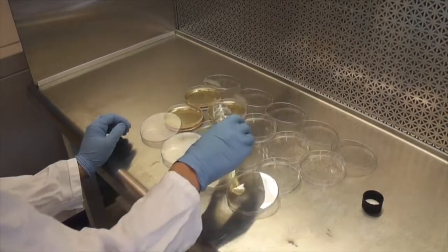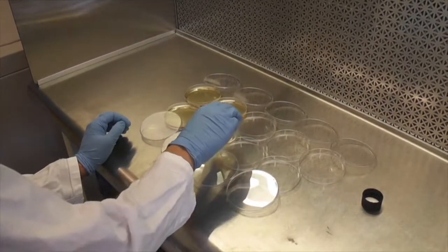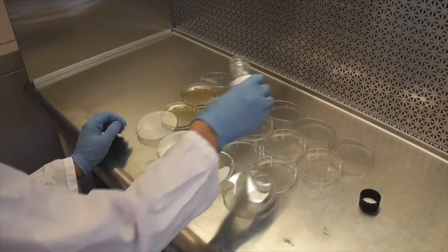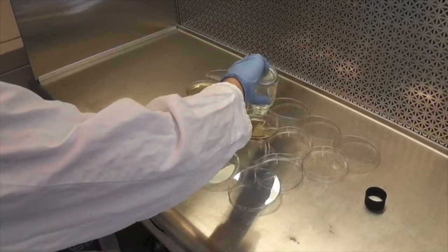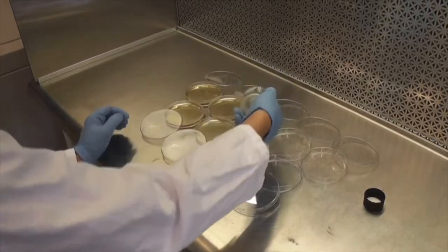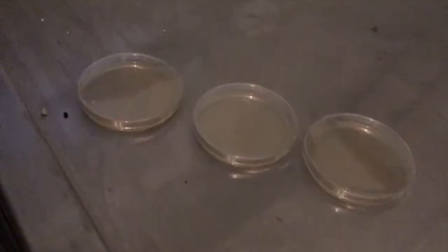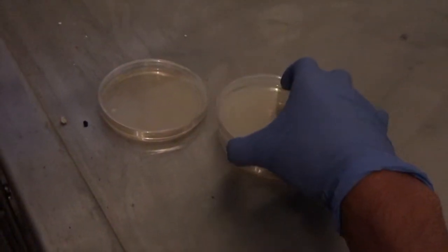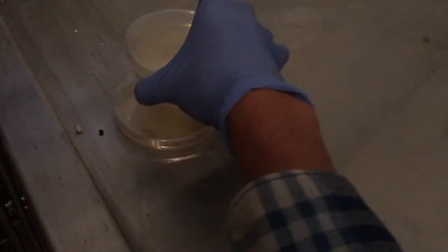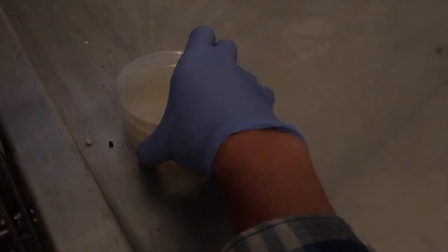If bubbles do form when working on a benchtop, they can be removed with a Bunsen burner or flamed inoculation loop. However, flaming plates supplemented with antibiotics risks inactivating the antibiotic. If pouring a large number of plates, pour in batches and stack plates that have already been poured. This will help prevent reaching over poured plates, thus reducing the risk of contamination.